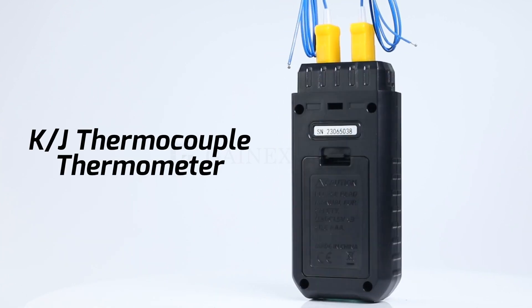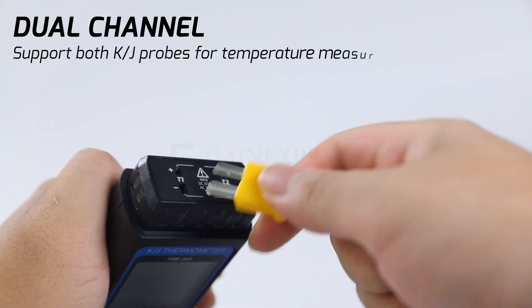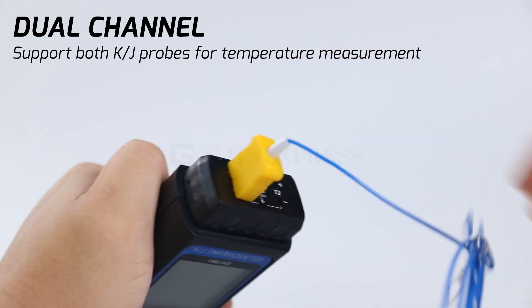KJ thermocouple thermometer. This dual channel thermometer supports both K and J probes for precise temperature measurement.